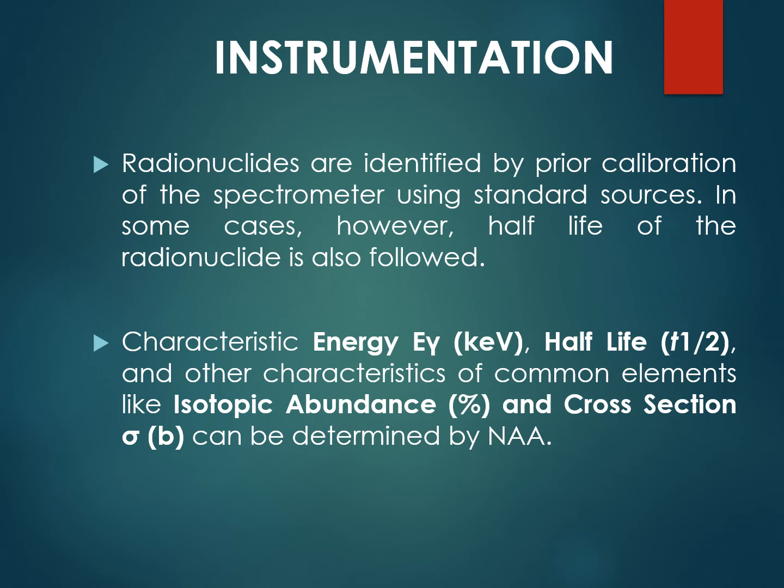So in all these classifications or instrumentations, the radionuclides are being used, identified, and detected. They work in different ways to examine the results and draw further conclusions.